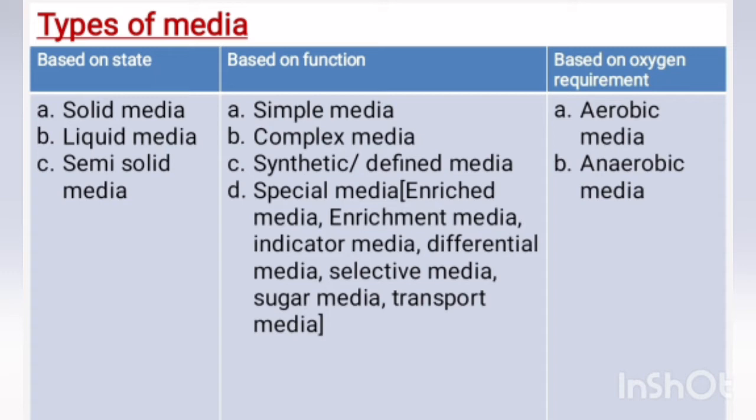Based on it, media is classified into aerobic media and anaerobic media. We can discuss each and every media with example.